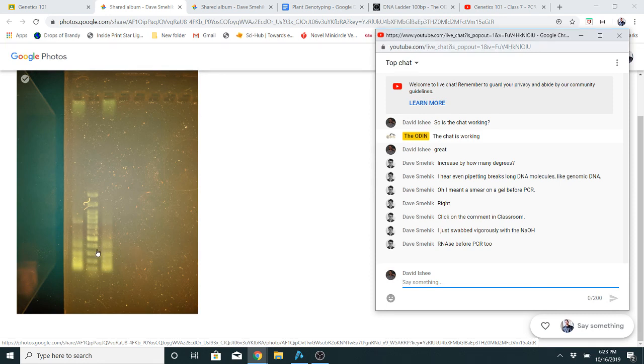DRD4 protocol. So there's 2 different versions of that gene. Well, there's actually many different versions, but there's a range of sizes for this PCR product. So one of them is between 300 and 400 base pairs. That's sort of the normal one. And then there's the risk-taking behavior associated version that has a larger product.